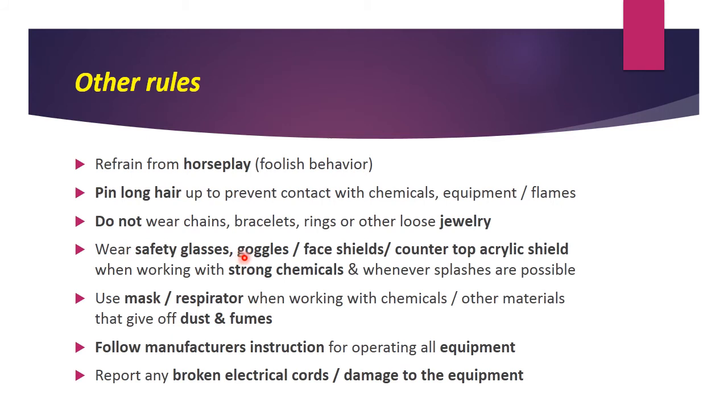Wear safety glasses, goggles, face shields or countertop acrylic shields while working with strong chemicals, because sometimes there is the presence of splashes. In order to avoid splashing into our eyes, we can make use of this personal protective equipment.